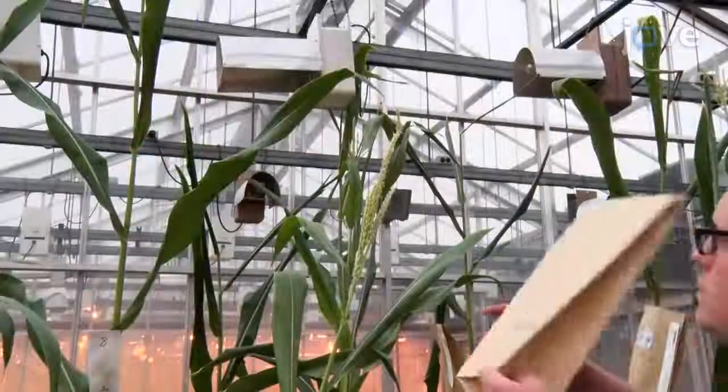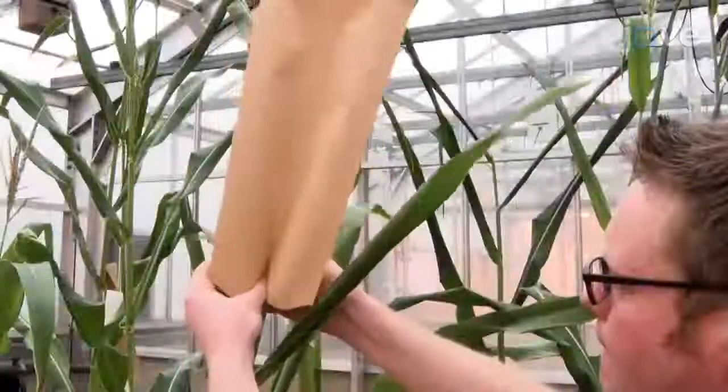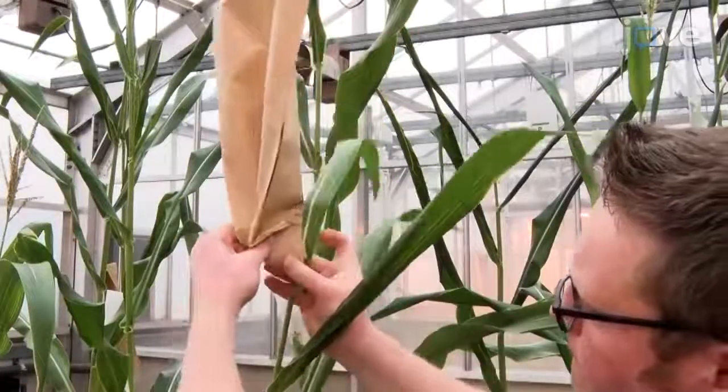Once anthers emerge from a tassel, cover the tassel with a tassel bag and place a non-skid paper clip at the base of the bag around the stalk.